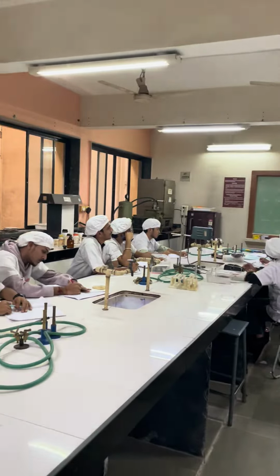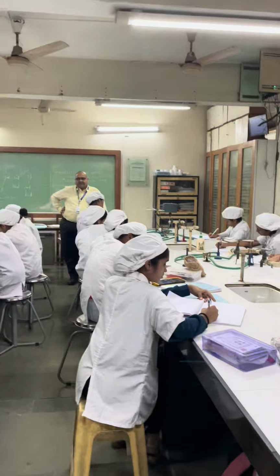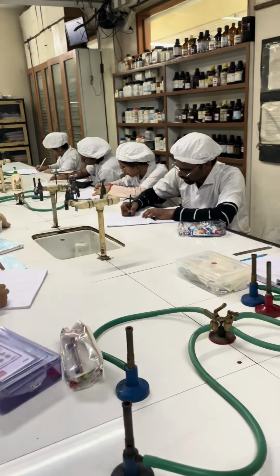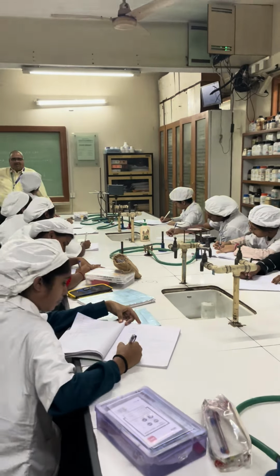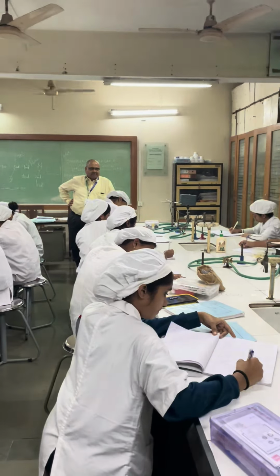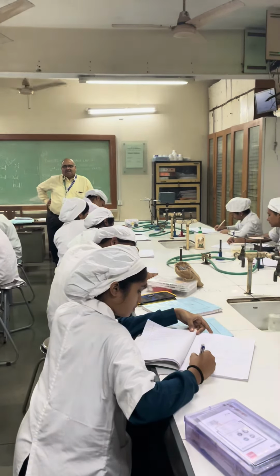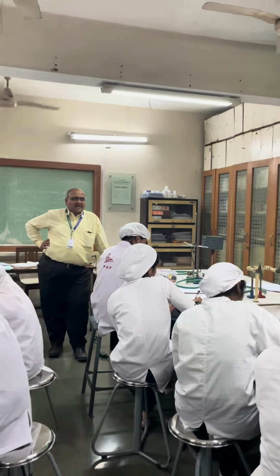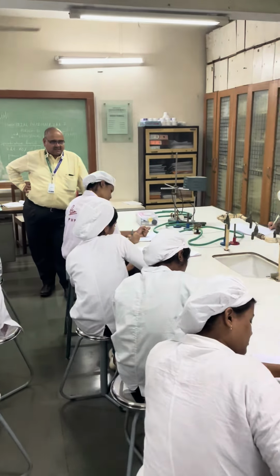Here, the requirements for this practical are: number one, sterile lactose fermentation broth test tubes, single strength and double strength; water samples W1, please write in a bracket tap water, and W2; sterile pipettes of 1 ml and 10 ml capacity.